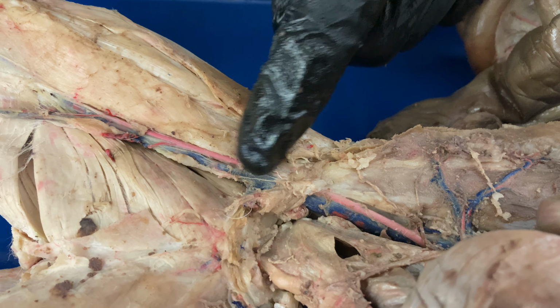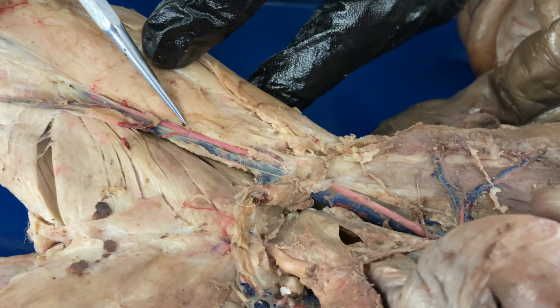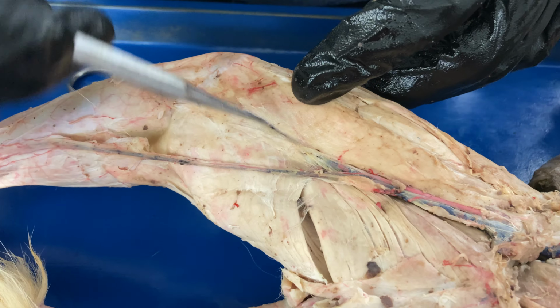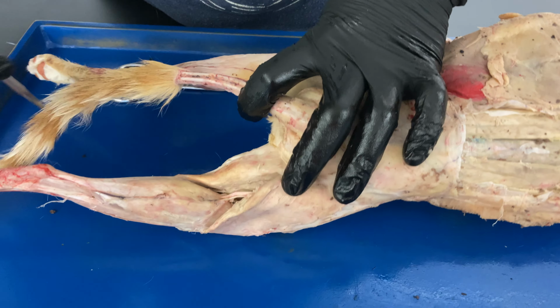Okay. You can see that the vein is much larger than the artery. As we continue on, the femoral artery is going to go almost to about where the knee is, and then it's going to plunge in, and it's going to work its way back behind the leg. So I'm going to show you. Let me flip the cat. See if you can see it here.